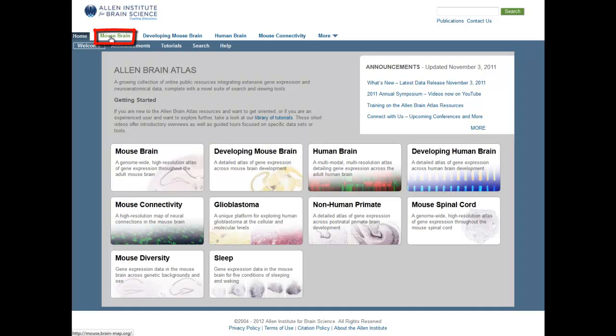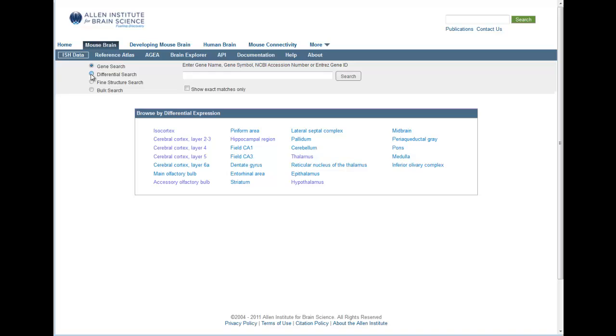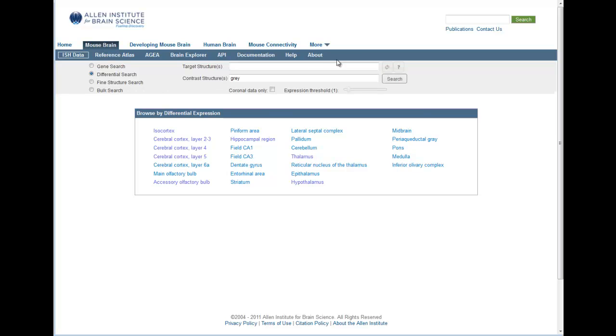First, go to our website at www.brain-map.org and click on the Mouse Brain tab in the banner. Make sure the differential search radio button is selected.